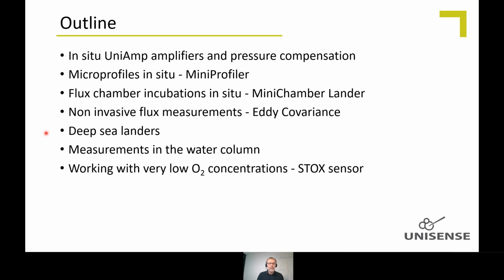Talk a little bit about deep sea landers. Then about measurements in the water column. If you want to just profile the water column, you can also use our sensors. Then at the end, I will spend some time on working with very low oxygen concentration using the STOX sensor, which can go very low in detection of oxygen. Yeah, let me start here.